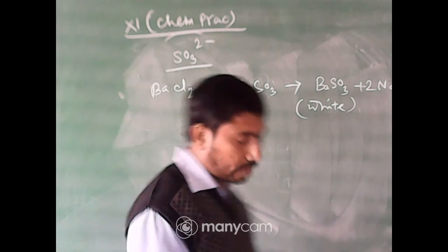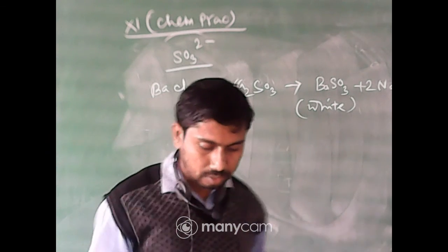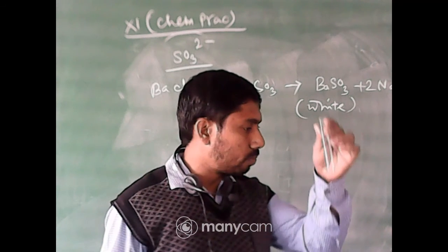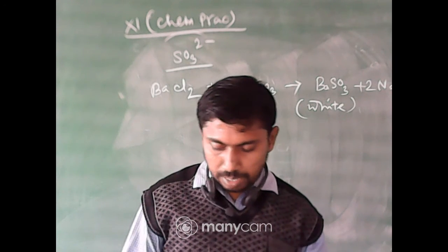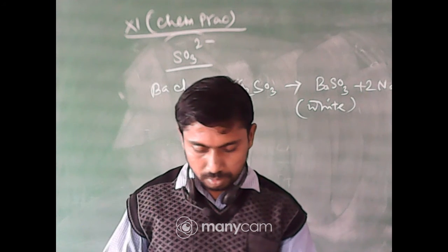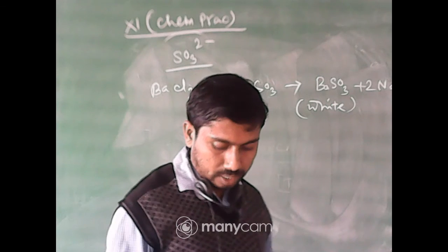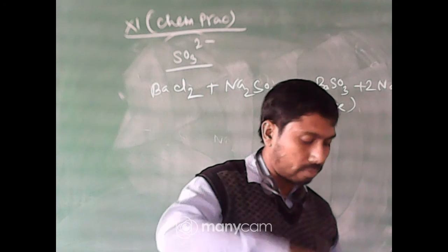So, in the same way, we will produce the solution for this. So, taking a test tube we will go for the wet test. So the sample is taken. Okay. Next, addition of water to the sample.